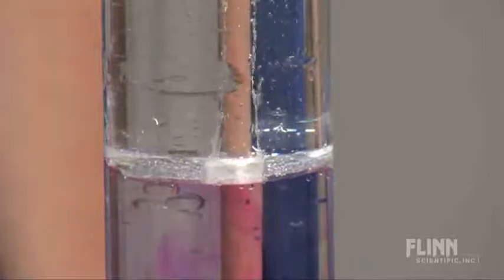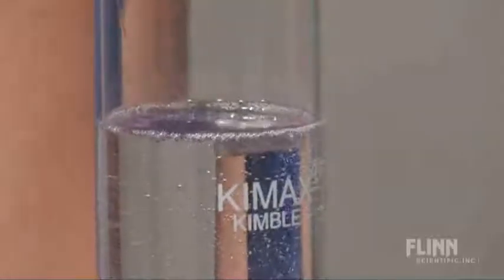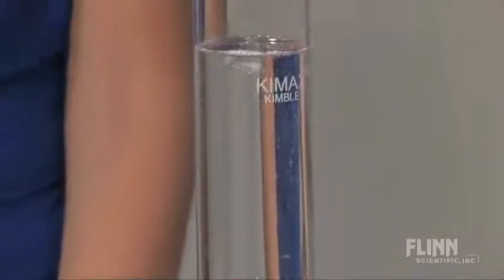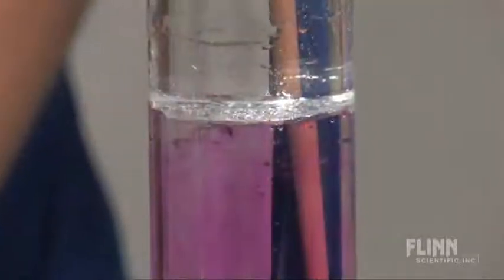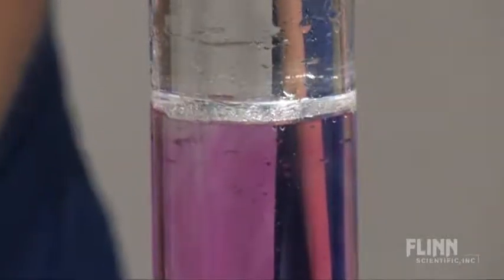Phenolphthalein is in the water layer, so when the sodium produces sodium hydroxide, it makes the water pink. The hydrogen bubbles carry the sodium back up through the mineral oil layer, and when it reaches the top, the density of the sodium allows it to fall back down, and the reaction happens over and over again in slow motion. This allows the students to see everything that happens in the reaction.